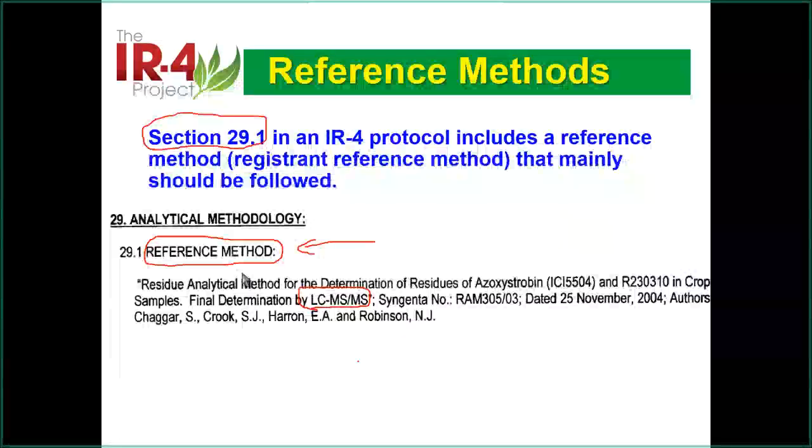And you may not have LC-MS in your lab. Then you will say, oh, yeah, this doesn't work. Then you have to spend more time to work on this chemical. So another thing depends on the matrix. If they say, okay, this is a crop, that means it's a lot of crop samples, but the matrix may be different crop. So in this case, it may or may not work. So you need to validate.